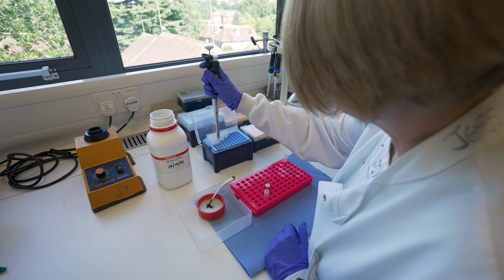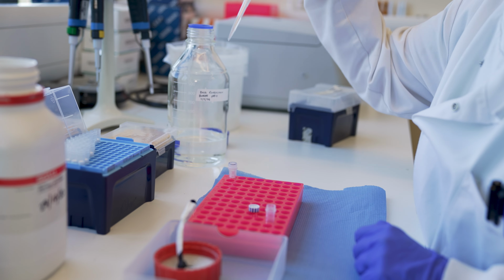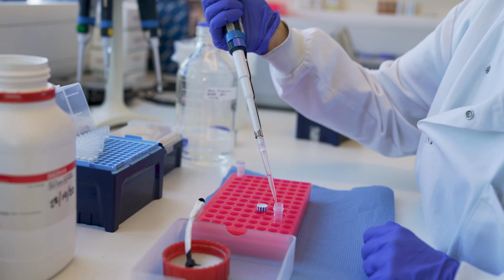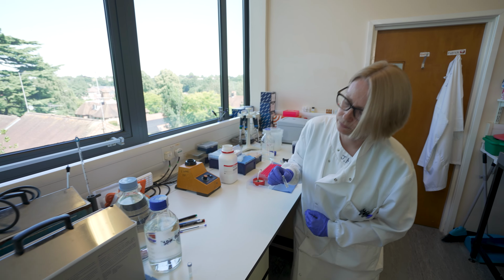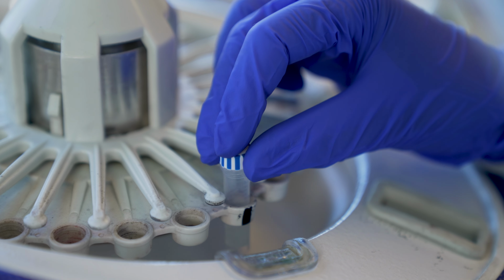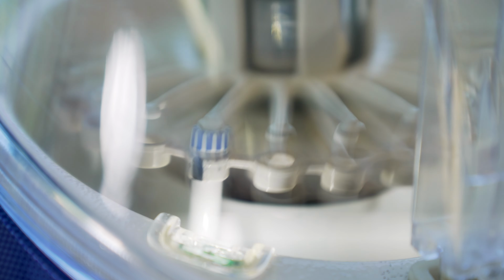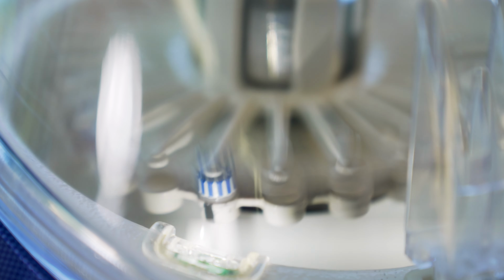My role is to process the air samples as they come off the spore traps, collecting the DNA to determine accurately the amount of fungal pathogen in the air samples. Each fungal pathogen has a unique DNA sequence which we can then target and amplify, getting results more rapidly and more specifically than traditional microscopy methods.